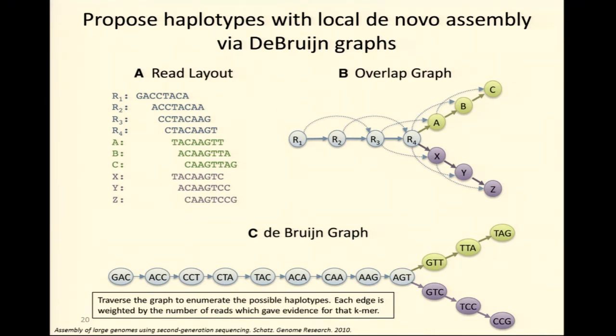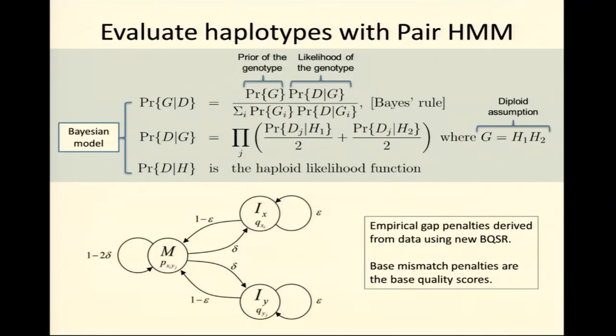But we do that in the haplotype caller, and we have managed to get the haplotype caller to run maybe 2 to 3 times slower than unified genotyper, but it's getting there. And there are some data sets in which it's actually even faster now. So in the end, soon it will be as fast and as good as unified genotyper in the overall case.